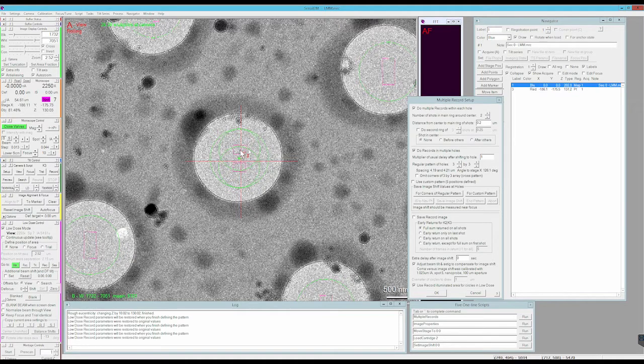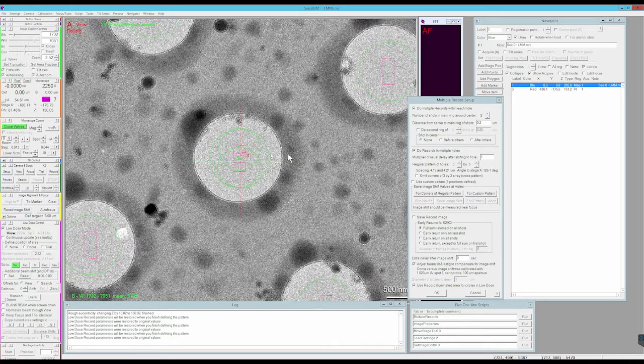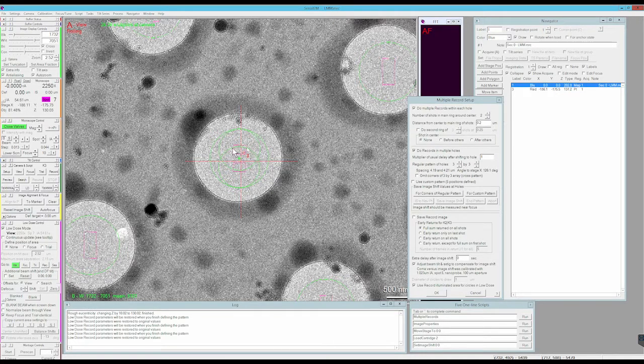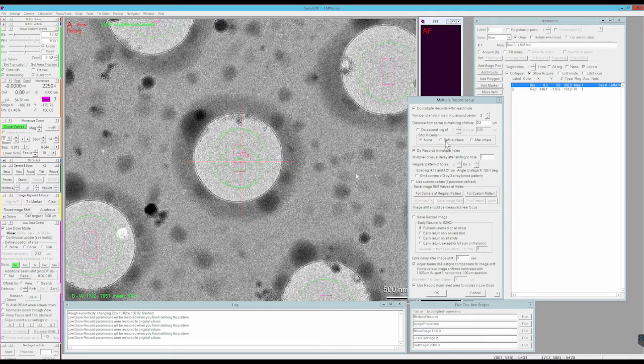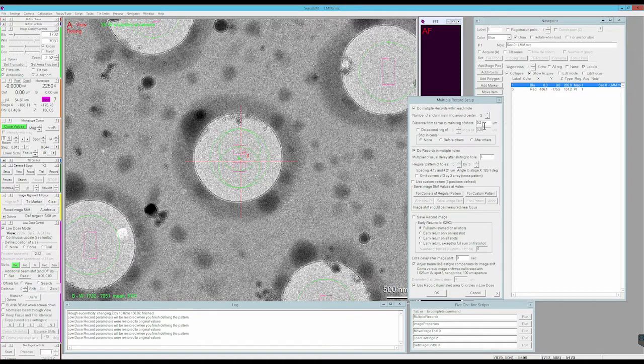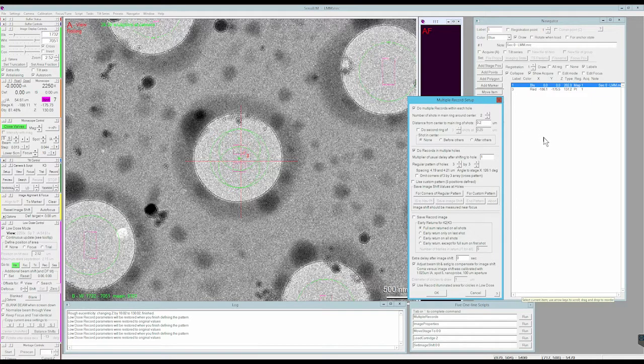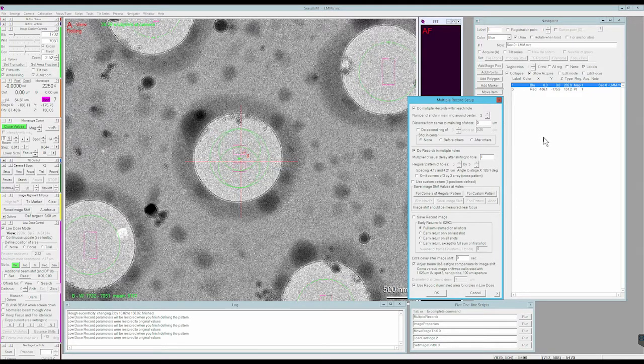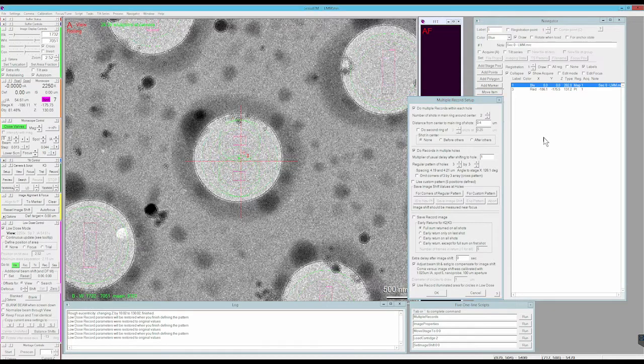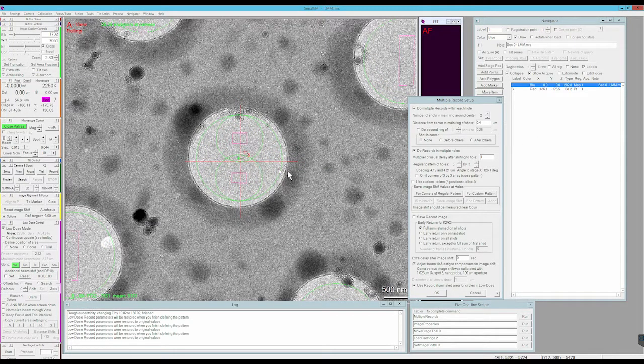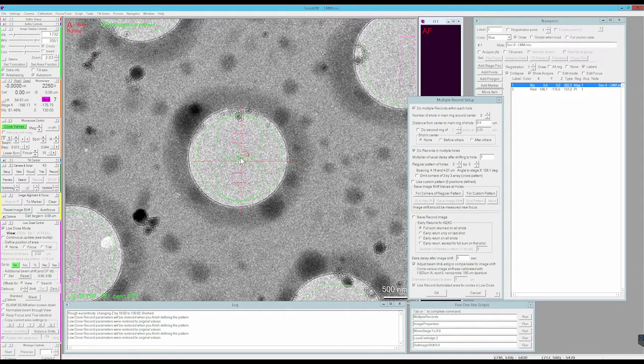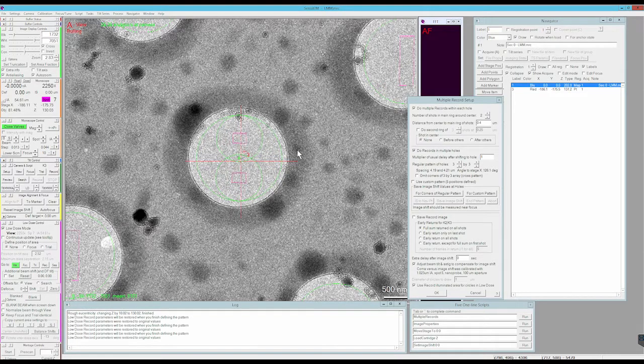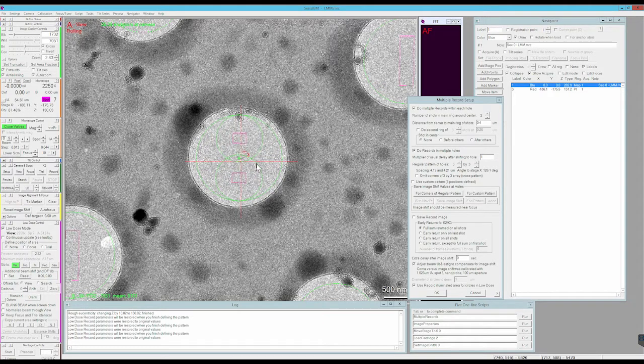The field of view of the camera is the magenta rectangle, while this green circle around each of those rectangles is the beam diameter. You can see that with this two hole spacing, the beam for one gets into the field of view of the other, but I have a lot of area. So I can adjust this value here, distance from center to main ring of shots, and let's change that to something like 0.4 and hit enter. Now I'm doing a lot better spacing wise.